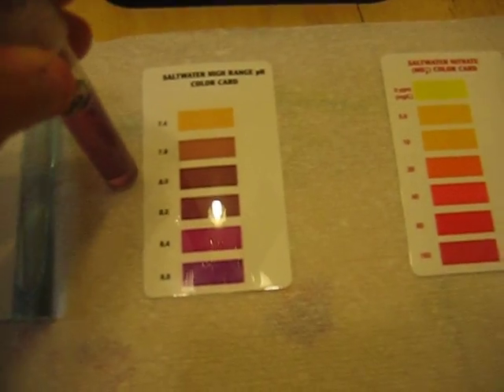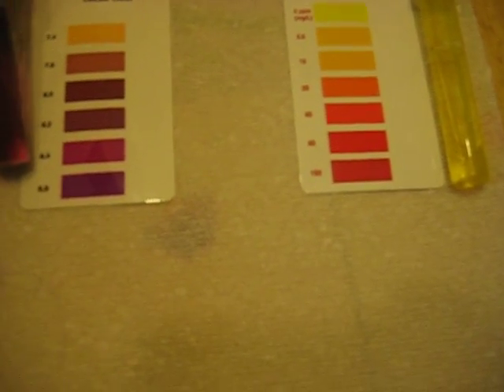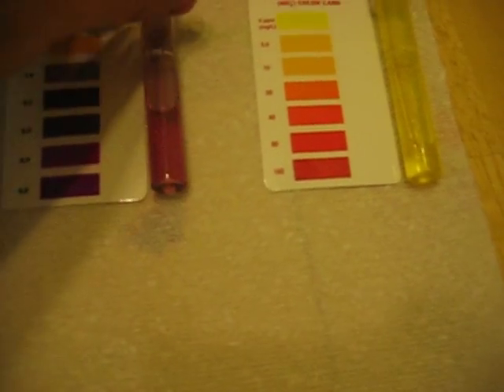We have the pH here, which looks to be in between the 8.2 and 8.4, a little closer to the 8.4, but that's okay.